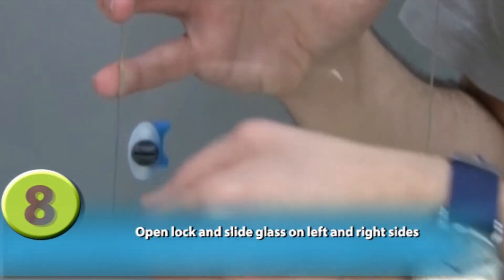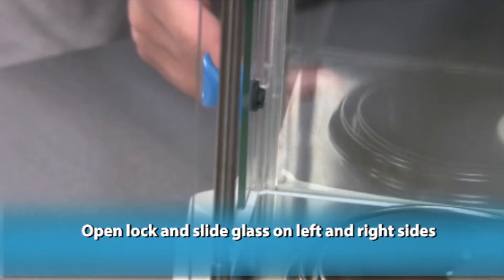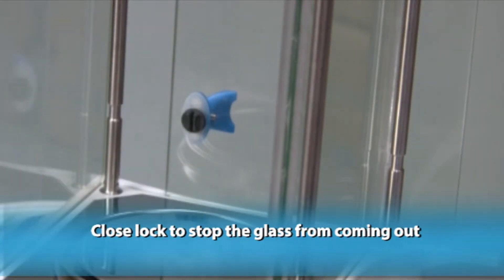Open lock and slide glass on left and right sides. Close lock to stop the glass from coming out.